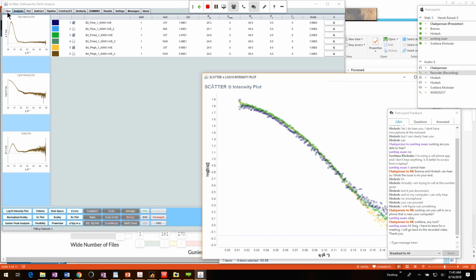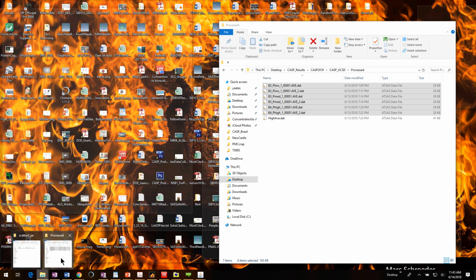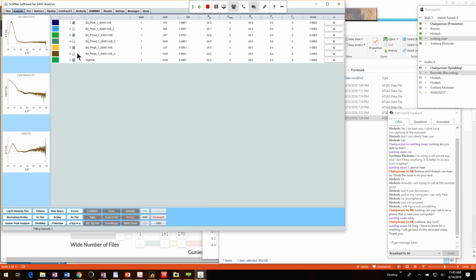I've done that already, and I'm going to import my corrected form scattering curve, which is a merge of all the best qualities of every piece of data. I'm going to drag and drop this AV here. Analysis. I'm going to unclick this.